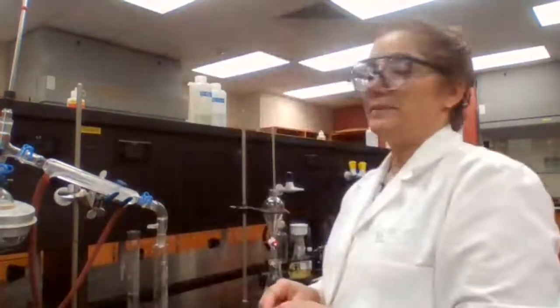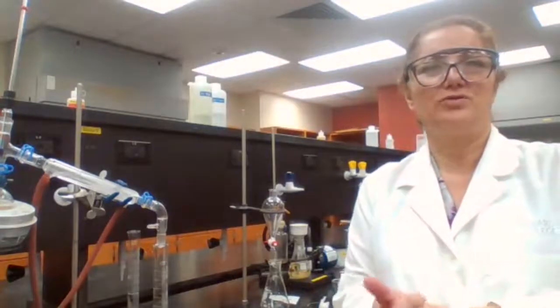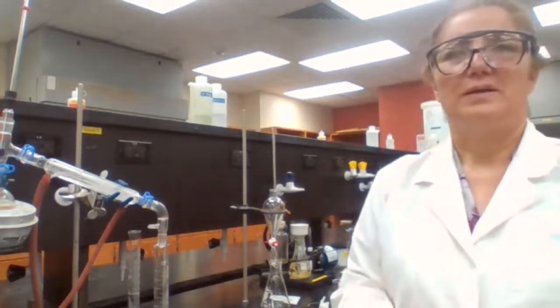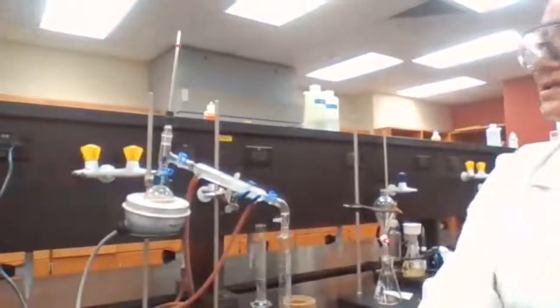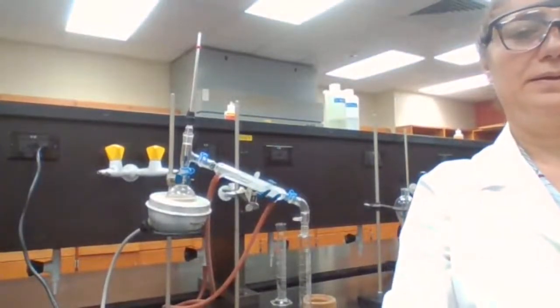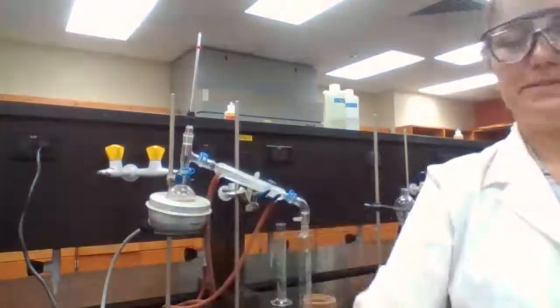Almost boiling, not yet. The polarimeter that we have out here, I'm not sure if it's working or not. I'm just going to have to work on that to make sure it is working. And then you watch the distillation for me for now. I'll be right back, okay? Be right back. So if you see too fast of boiling, send me a message.